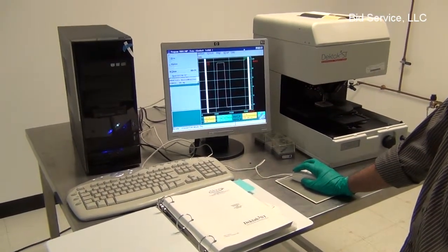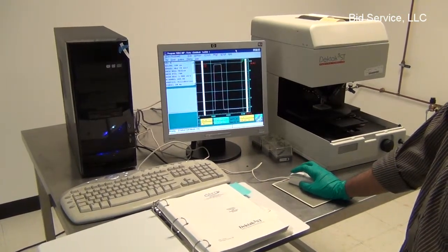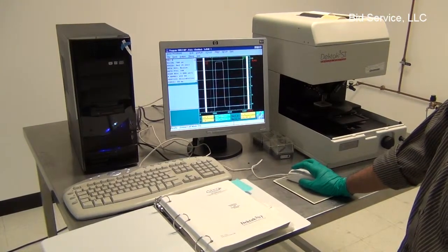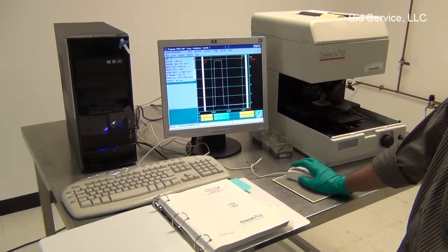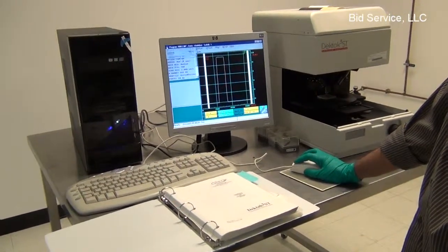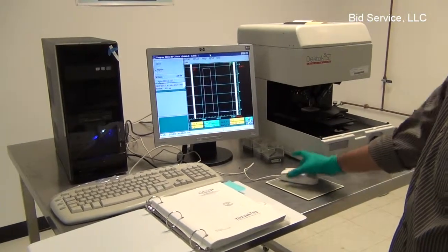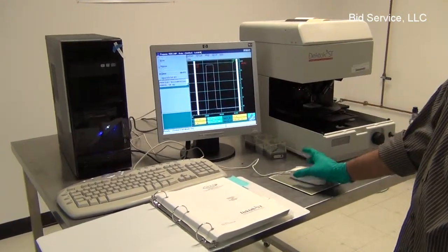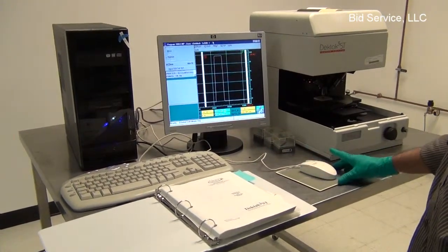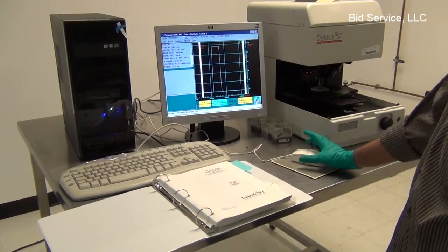The application software pops up as soon as the system is powered up, and once enabled, it's possible to control the system from the optical mouse, which is connected to the serial port on the personal computer. It's not a regular mouse.